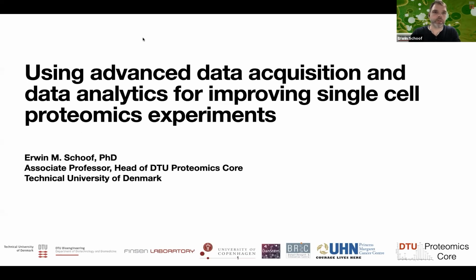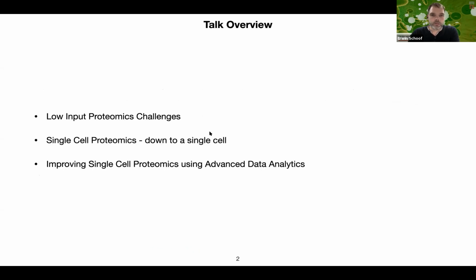I'm very excited to give you a brief overview of what we've done using SpectroMine in our single cell work, and how we're trying to push the maximum performance out using both advanced data acquisition, but especially data analytics for improving our single cell proteomics experiments. Today I'll be talking a little bit about the challenges of doing low input and single cell proteomics and explain how we've established such a workflow, and then spend the vast majority of my talk on how we can use advanced data analytics as provided by SpectroMine for trying to get the deepest proteome coverage possible.